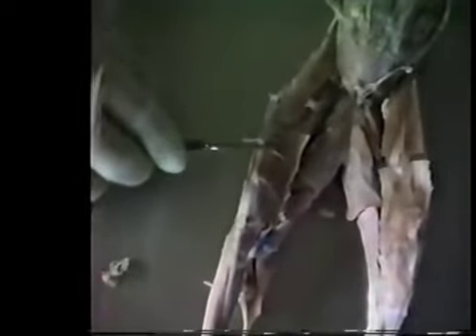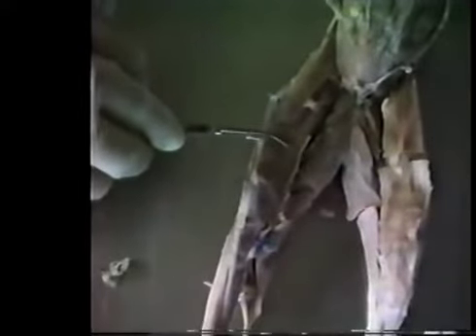inside of the thigh. We have these muscles that we cut earlier in our dissection video. This muscle that we cut here is the sartorius, and this is the sartorius on this side. Then here and over here is the gracilis muscle.